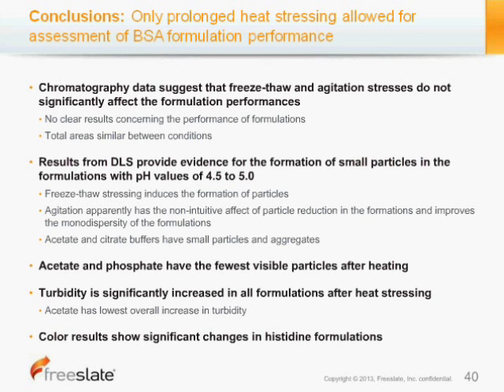So the first thing is that the chromatography data, as I mentioned before, suggests that the freeze-thaw and agitation stresses don't significantly affect the formulation performances, specifically in regards to the protein's stability.